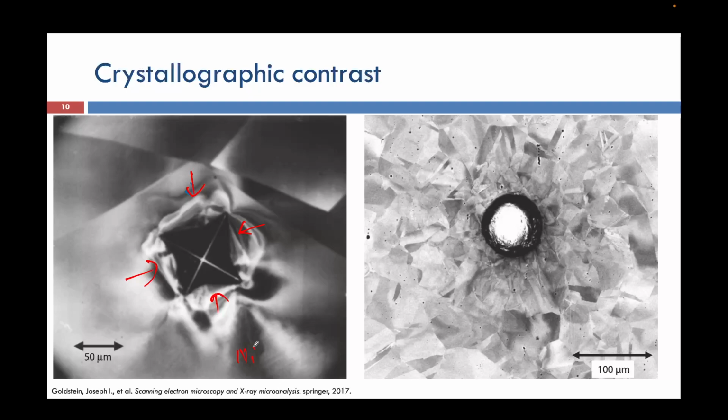So here this is plastic deformation that we will be able to see, and another thing, we will be able to see residual stress patterns also. Here some strain map also we will be able to see. This is also after plastic deformation. So what are the residual strains in this image?